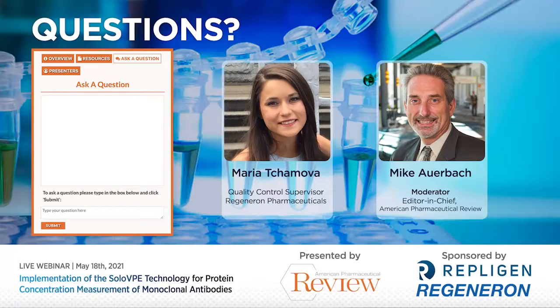Do the quickset couplers have an established shelf life, and how often do you have to change them? They are changed annually during the preventative maintenance service. You will also have spares included with every system if needed in the interim.